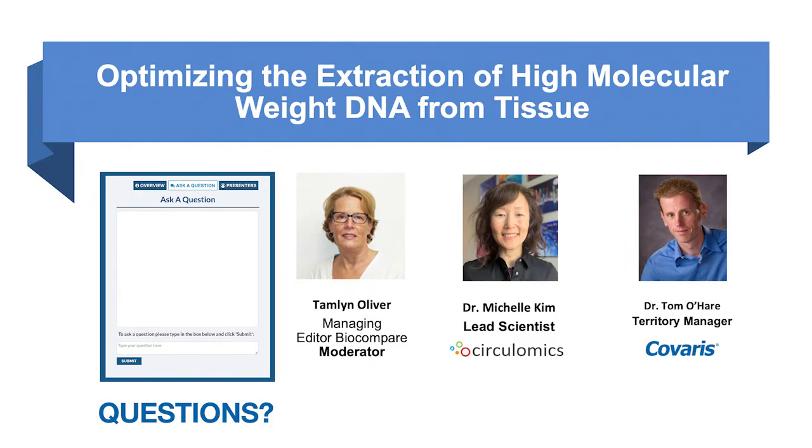What is the quantity of tissue required with Nanobind and cryoPREP? So generally, if you're doing one extraction, we recommend 25 mg. And Mary said that the minimum for cryoPREP is, I believe you said 2 milligrams? Or did you say 10 milligrams, sorry. I was just going to say that is a minimum I guess you would want to have in that bag, because you need enough tissue in that bag to actually be in the impact zone.